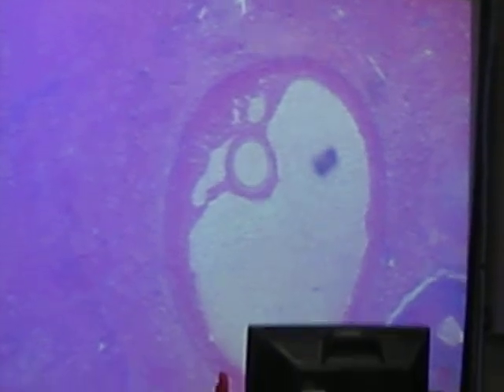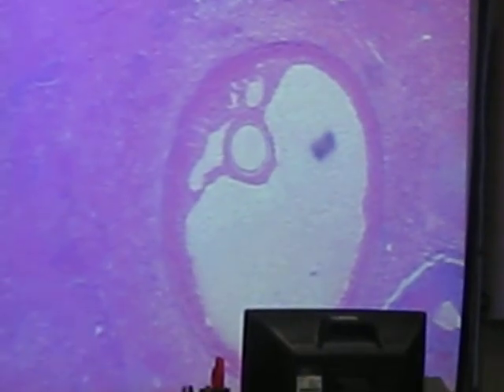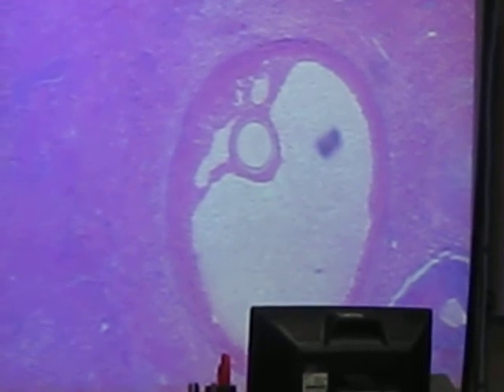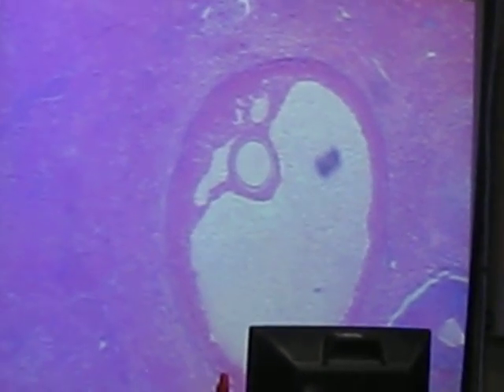So really, for identification purposes, you want to be able to identify your different follicles, understand some of the structures of the follicles, and what's going on with the oocyte at each stage of follicle maturation as well. I know that's kind of where we left off in lecture today, but you should be filling in. We talked about the maturation of the oocytes, and now you've got to take that along with the maturation of your follicle as well.